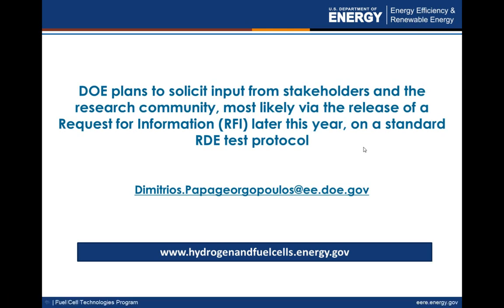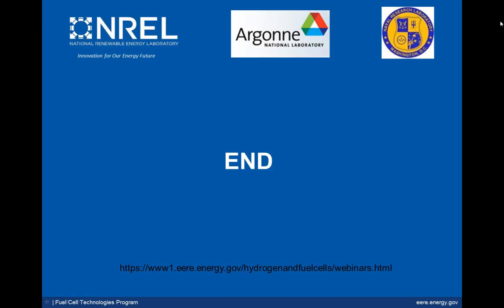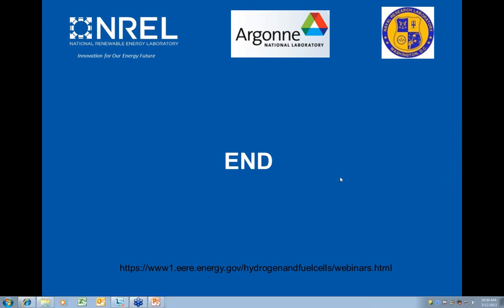And with that, I would like the speakers to address some of the questions that listeners sent in. The first one is related to the glassware cleaning procedure. The listener is asking if there is a reference available for glassware cleaning.